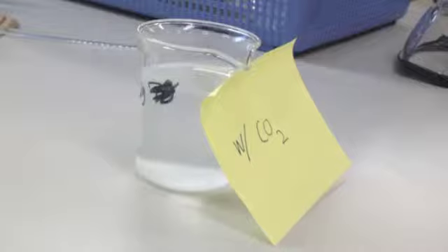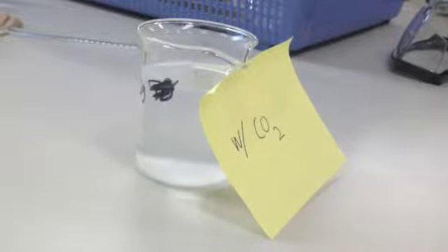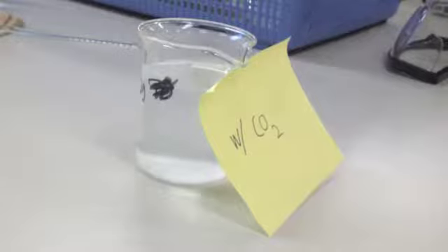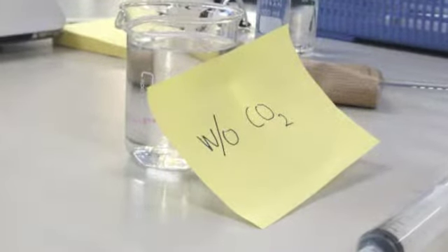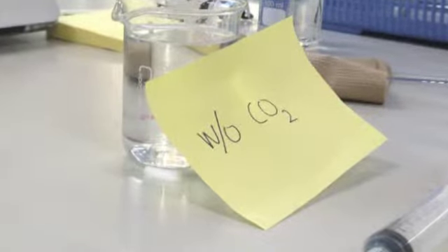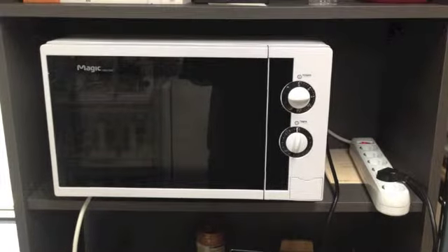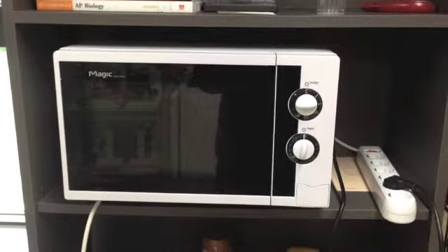Since our independent variable was the temperature, we didn't have to use one with the CO2 and one without CO2. We simply had to divide the 300 milliliters of 0.2% bicarbonate into 2 beakers and heat one of the beakers. This is the process of heating one of the 0.2% bicarbonate solutions for 30 seconds.